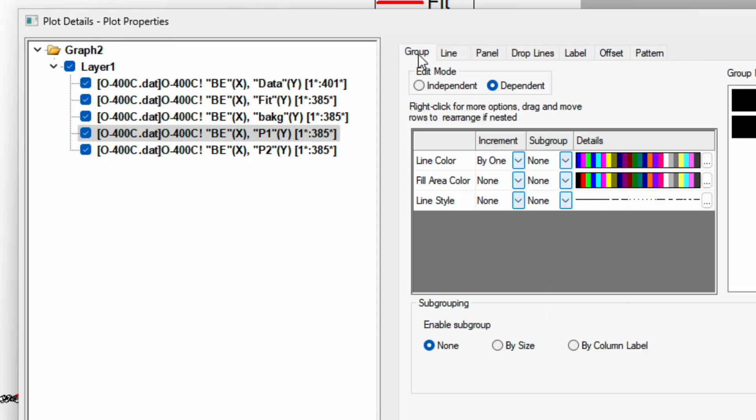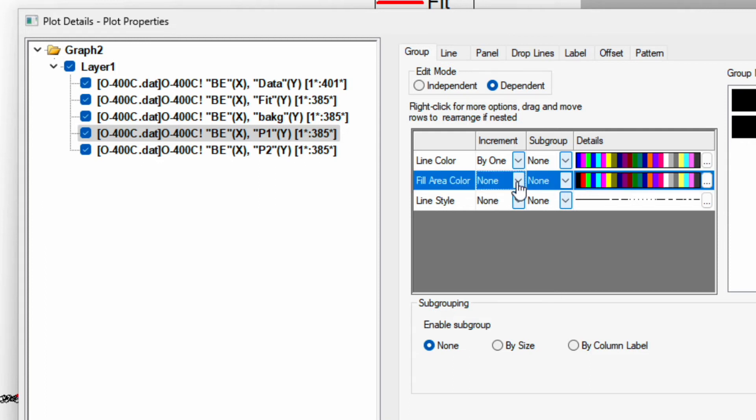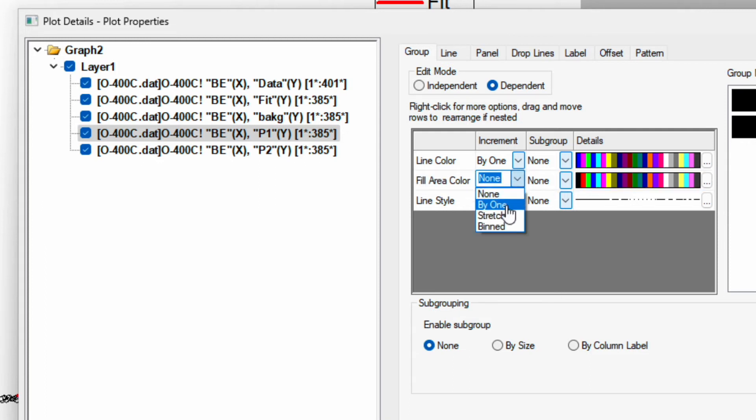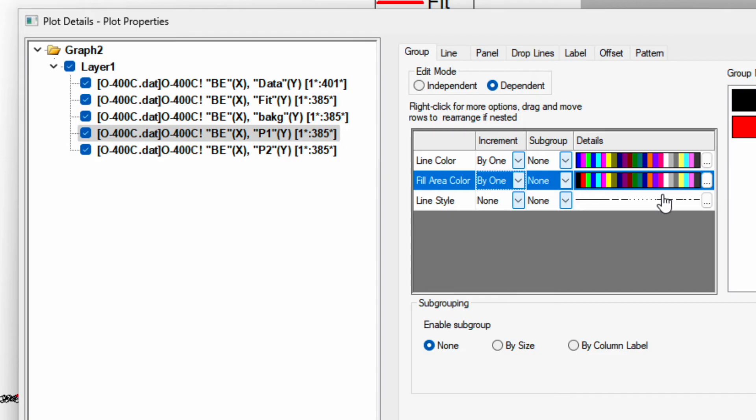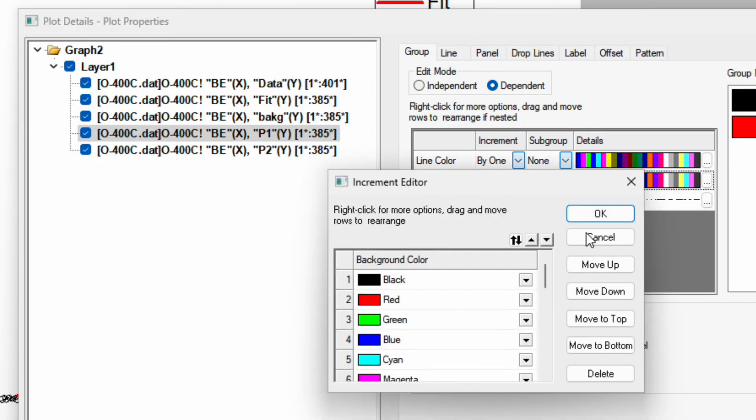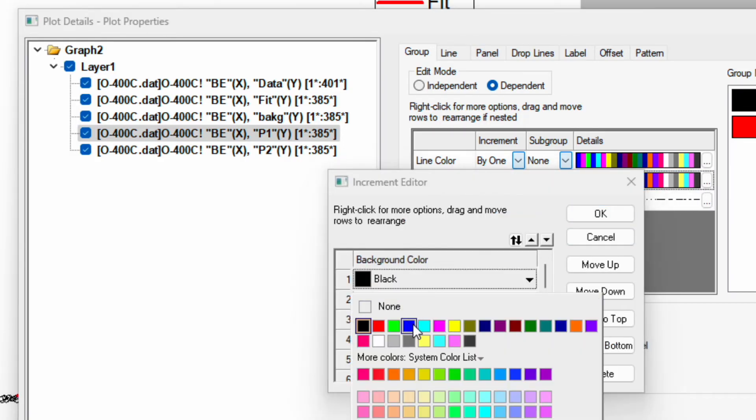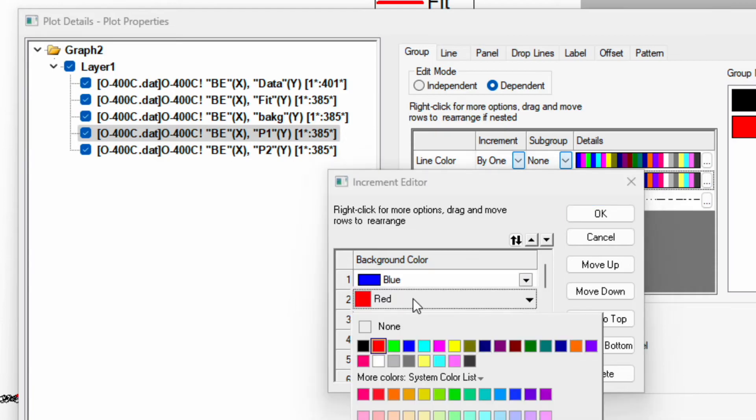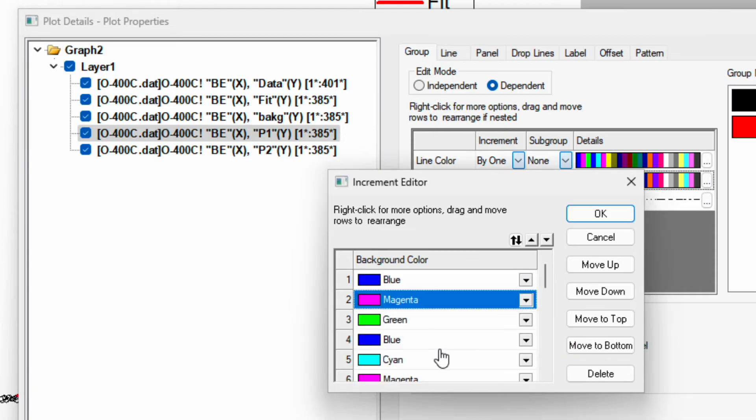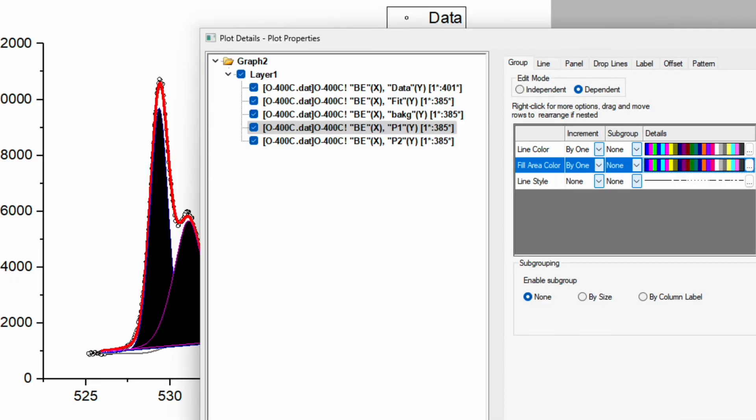Now go back to the group. In the group you will see fill area under the color option, so change from none to by 1. Click on these 3 dots and change this one to blue and the red to pink. Click OK and now apply. We can see.